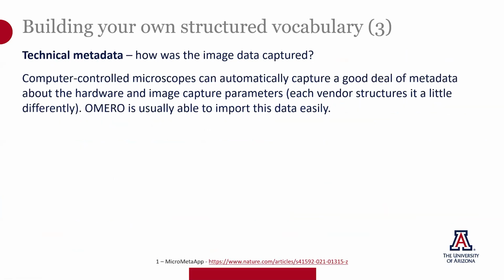Technical metadata tells you how the image was captured. If you're using a computer-controlled microscope, like a confocal or even a core facility wide-field microscope, those instruments are going to capture a good deal of metadata about how the image was captured. In general, that data imports very nicely into OMERO.